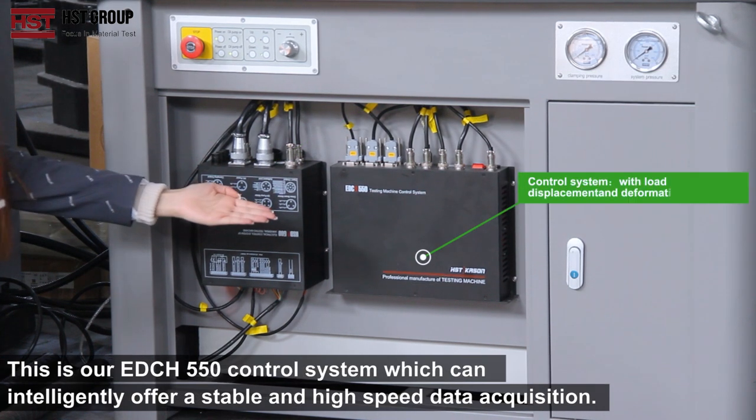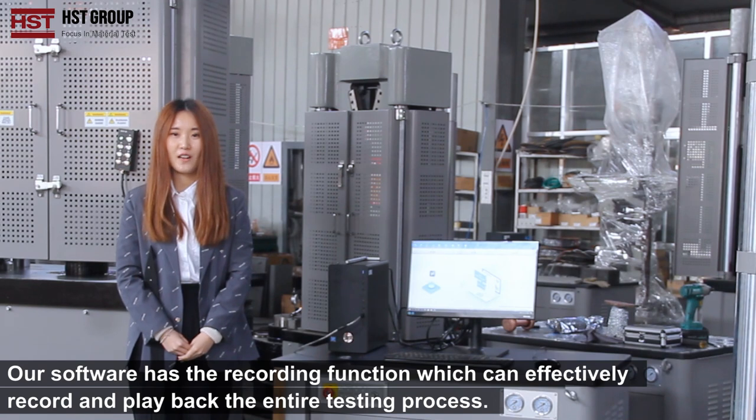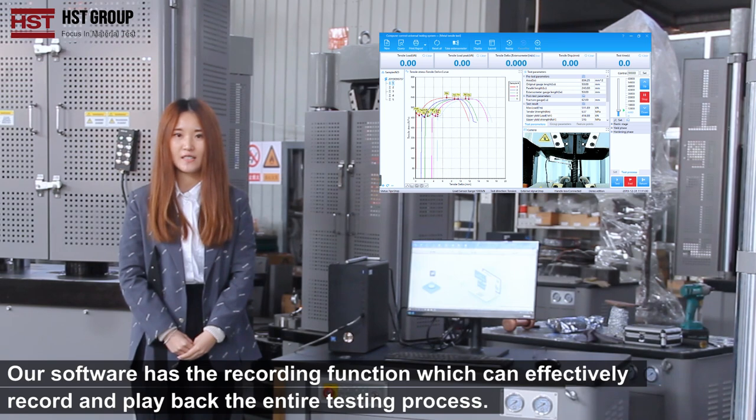This is our EDCH-550 control system, which can intelligently offer stable and high-speed data acquisition. It also provides a stable output power for the equipment and prevents any damage from unstable power supply. Our software has a recording function which can effectively record and play back the entire testing process.